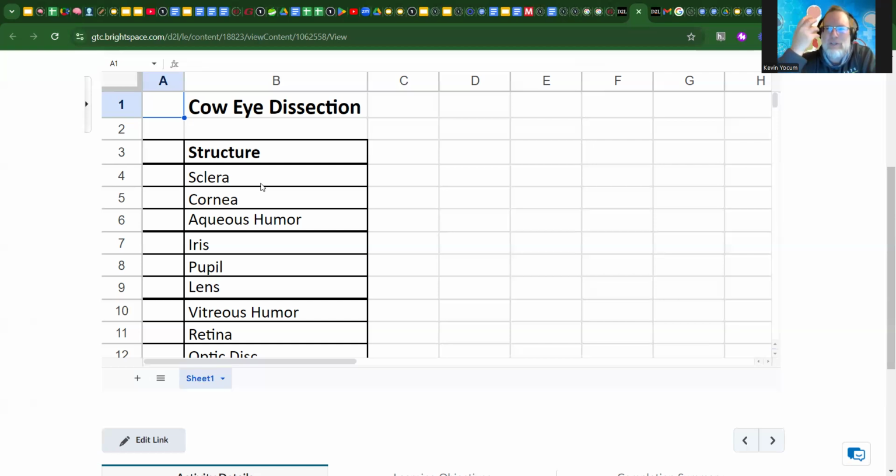And as you get rid of the musculature, you'll notice the whites of the eyeball. That's the sclera. And in the posterior aspect, you'll have that tube-like item coming out the back, a cream shape. That's the optic nerve. So you'll make note of that.